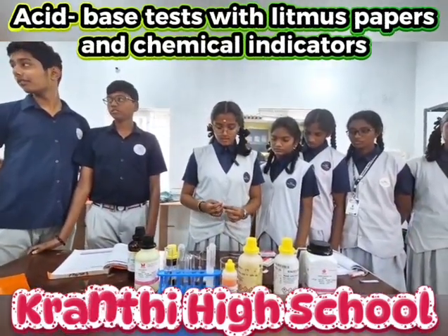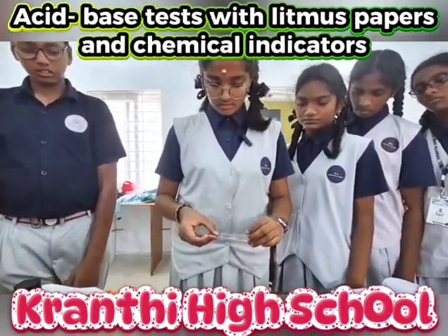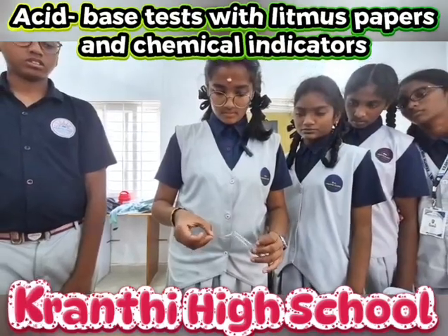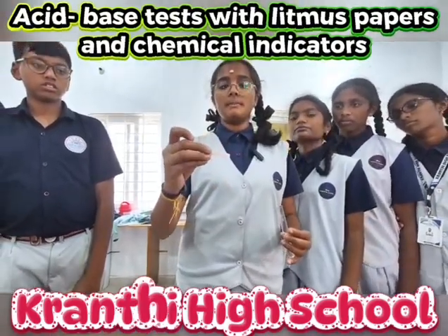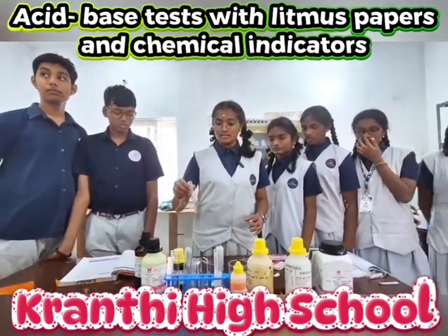As well as we are going to dip red litmus paper into the HCl. The red litmus paper did not turn into any color, shows that it is an acid.